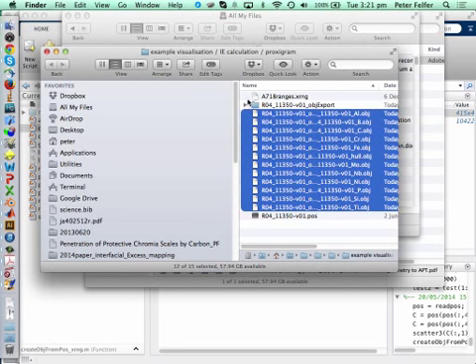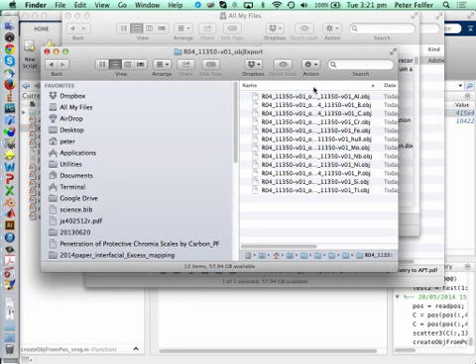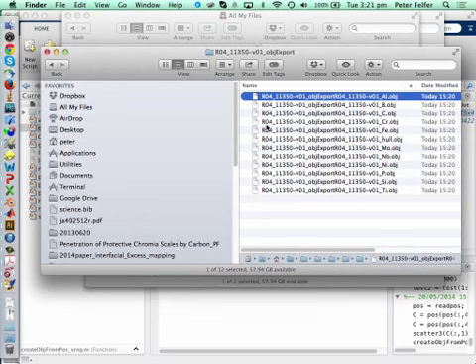I don't know why. It should according to the Matlab script. And if you go in there, you'll see we'll have the data. It's a very lengthy name, but it says where it came from. Doubles up on there a little bit. Sorry, I never went to fix up the scripts. But you can see you've got aluminium, boron, carbon, chromium, and so on.